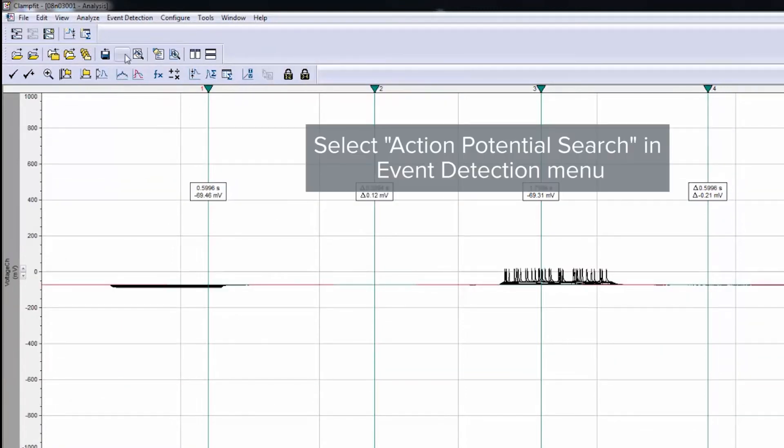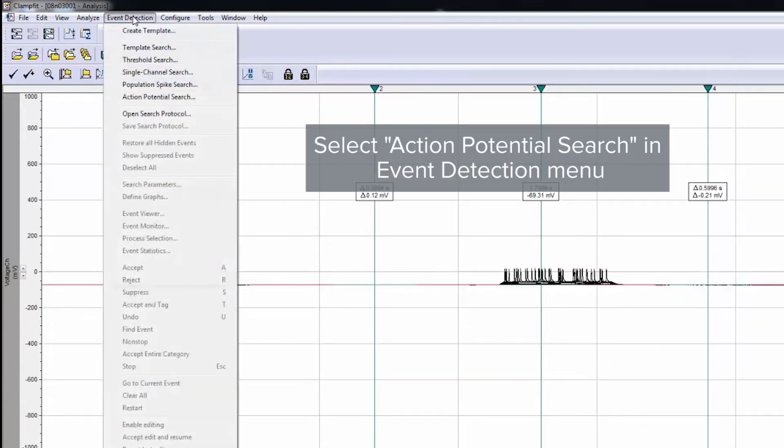Next, go to the Event Detection menu and click Action Potential Search.